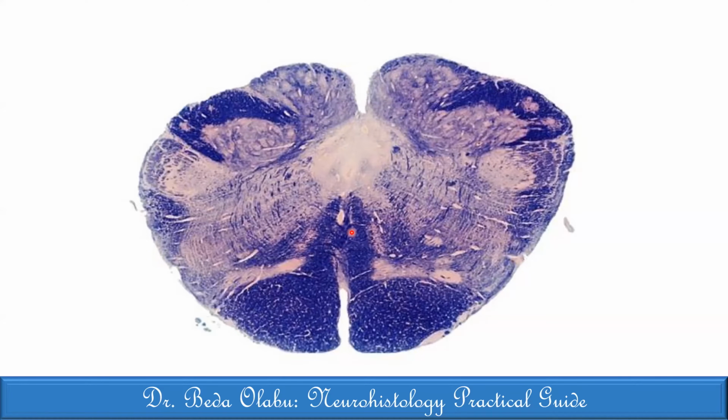And then also you can identify on the posterior end, you will find that there's some bluish, and also there's some lightish, I don't know what to call it, but those are the fibers of the gracile fasciculus that are medial, and then where you're pointing is where the cuneate fasciculus is.